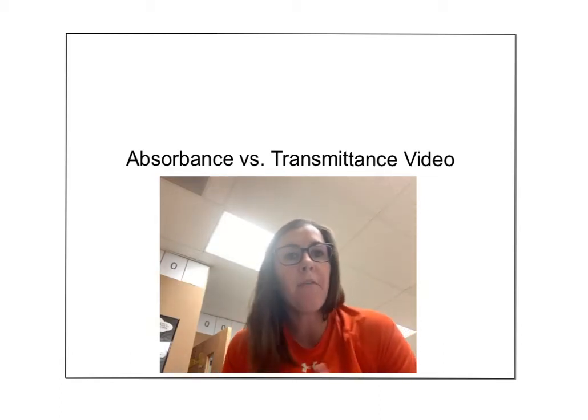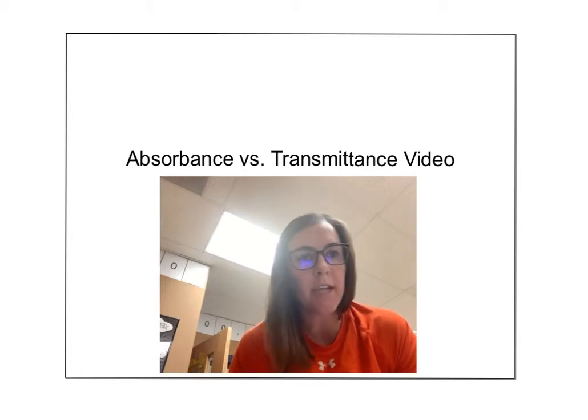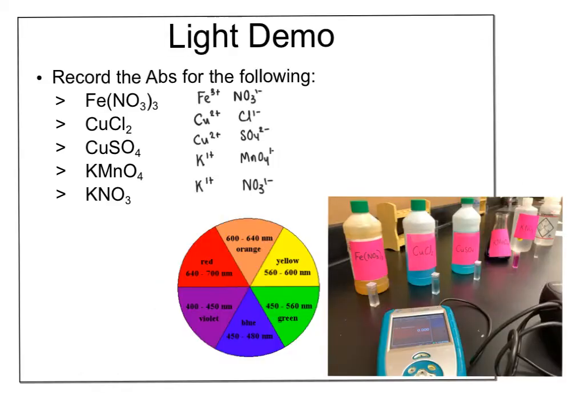I have a demo for you, and then we're going to talk about absorbance and transmittance. Alright, so here's the first part of our demo. I have lots of different chemicals: iron 3 nitrate, copper 2 chloride, copper 2 sulfate, KMnO4, potassium permanganate, and then potassium nitrate. And so we are going to record the absorbance for all of these.